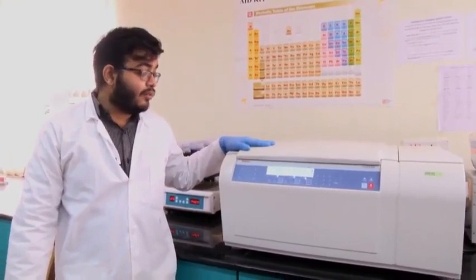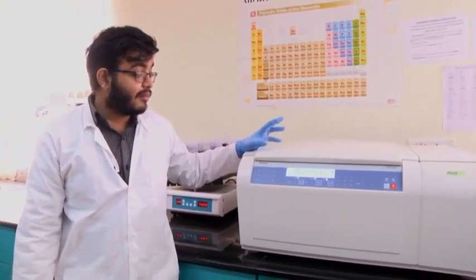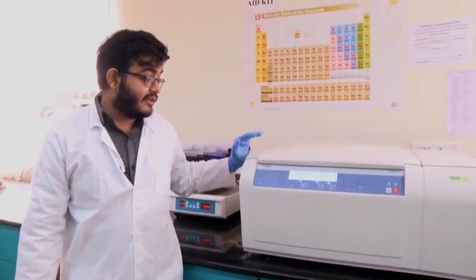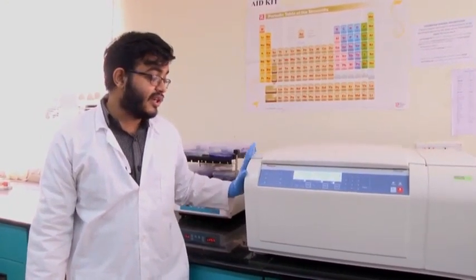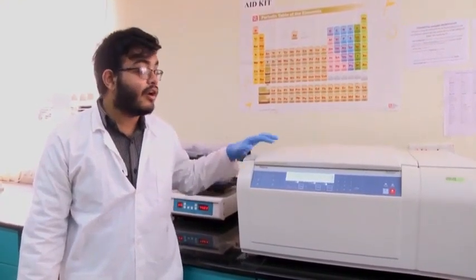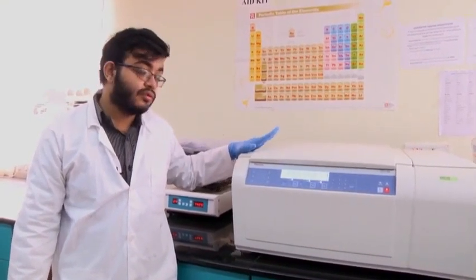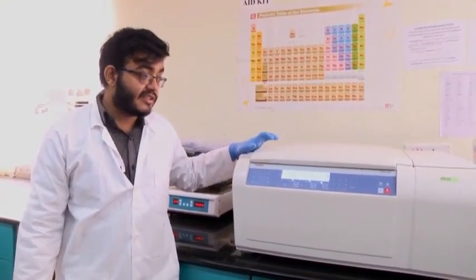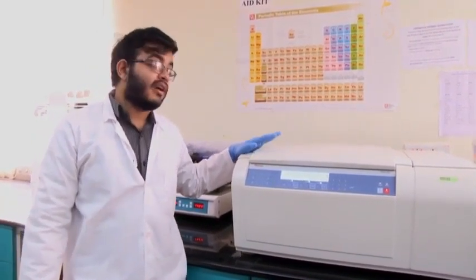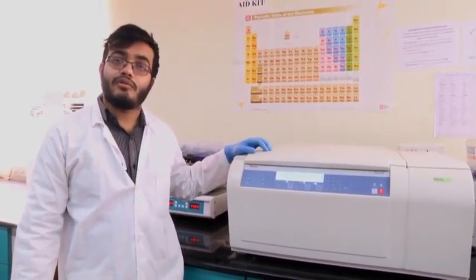What I have in front of me now is a centrifuge. It's a temperature controlled centrifuge, and its purpose is to centrifuge different samples. This means we can maintain it at 25 degrees centigrade or lower, maybe 4 degrees or 16 degrees, or even if required slightly higher. So we can centrifuge solutions using such centrifuges, and you will be seeing in the subsequent lectures that centrifugation is a very essential process required for many different experimental purposes in the laboratory.